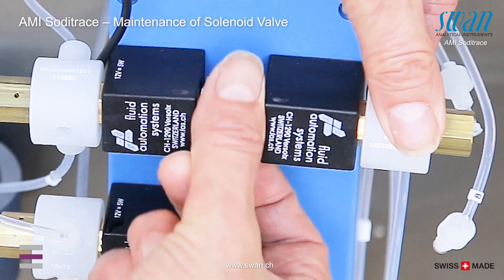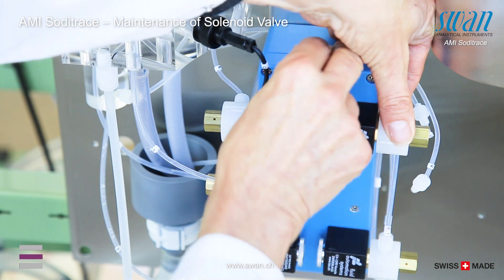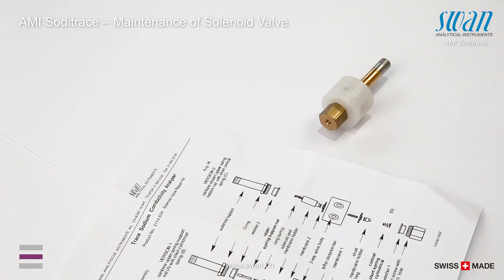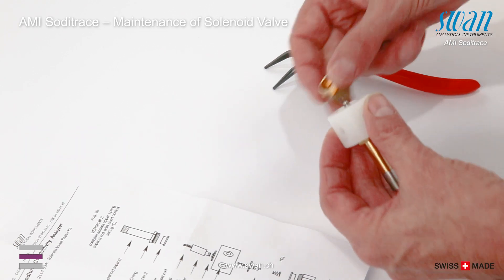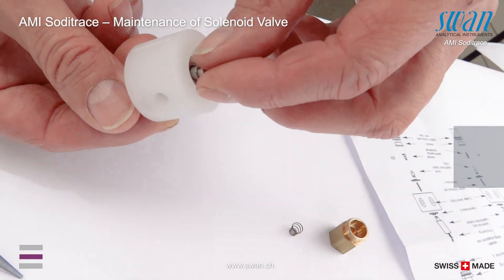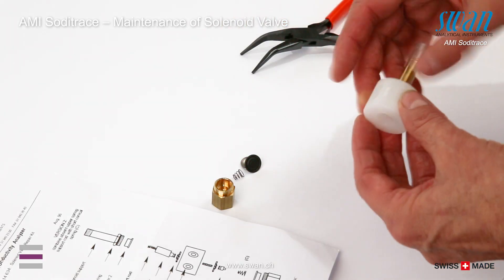Unscrew the knurled nut. Pull the valve assembly out of the coil body. Unscrew the solenoid support and bottom nut. Remove the membrane holders.